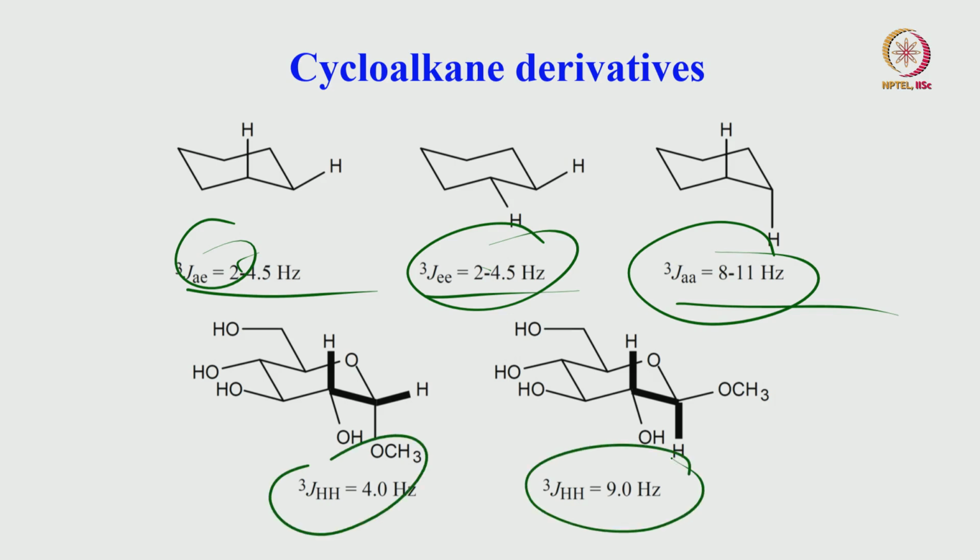Usually three-bond coupling is quite small, we say one-bond coupling is larger than two-bond and then three-bond. Yes, but the coupling strength also depends upon whether the molecule is linear, or has a zigzag pattern, all those things matter.